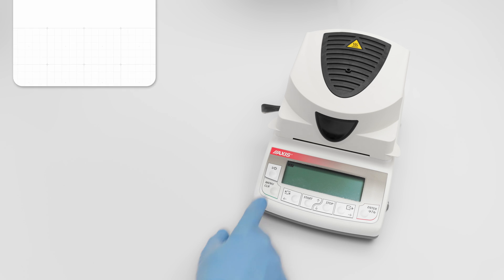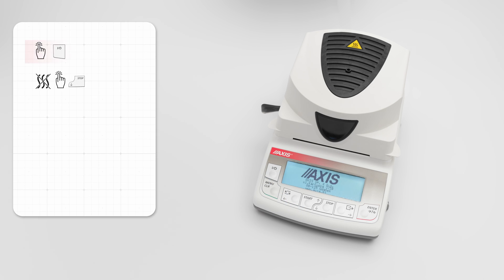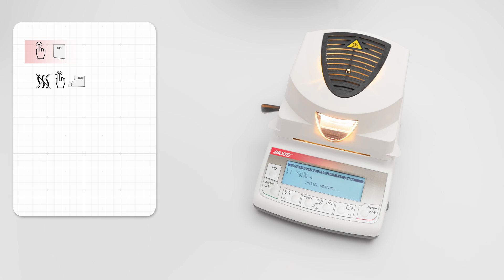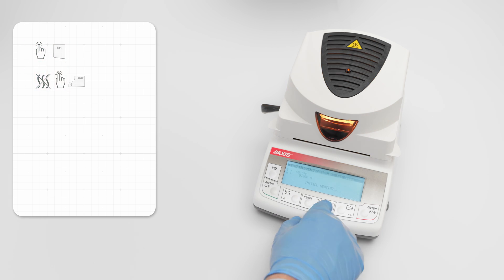A moment after switching on, the moisture analyzer starts initial heating to create appropriate thermal conditions in the drying chamber. Preheating can be skipped by pressing the stop button.